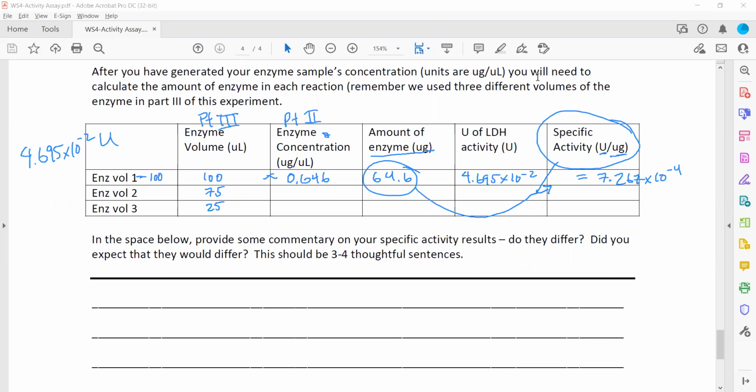All right, well, I hope that was helpful, and that's what we've got for this upcoming week's experiment. Look to your Canvas page for some videos walking you through how to use the Bio-Rad spectrophotometer, though.